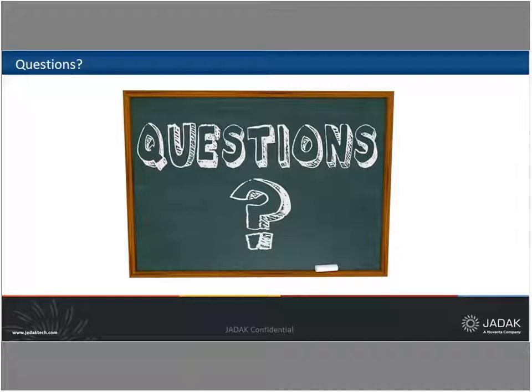Okay, thank you. Here's another question: in the presentation you talk mostly about HF RFID. Why don't you see more applications using UHF technology in this space? That's a good question, and actually you did see one application using UHF. It's really where UHF would shine in an inventory type application, where you're attempting to read, I think in that case, six or eight different reagents within that space.